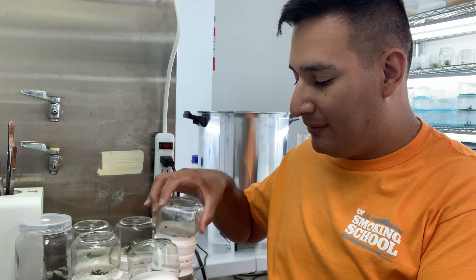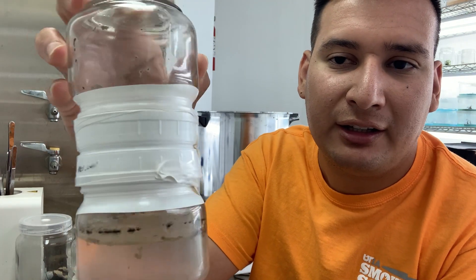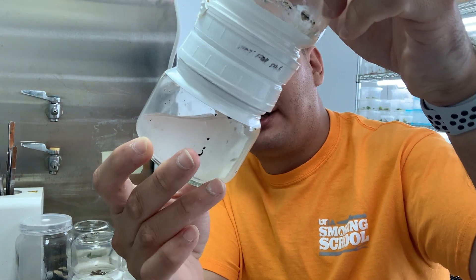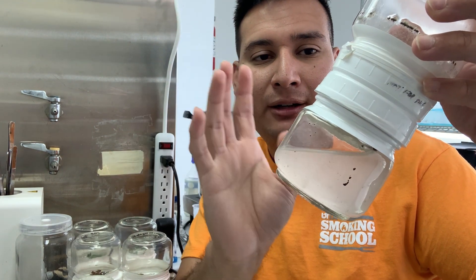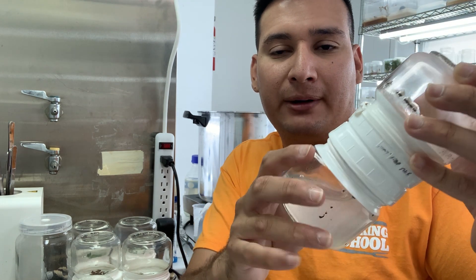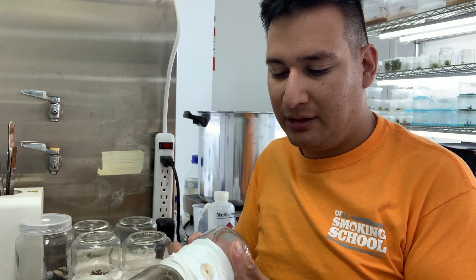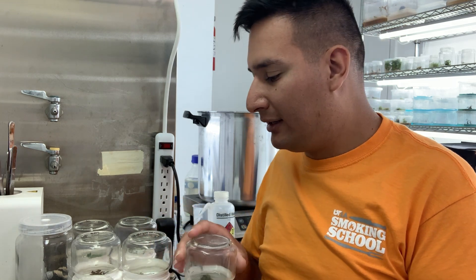Unfortunately, the Cephalotus got contaminated. I couldn't really notice it when I put the media in, but it was very cloudy, so I'm not really surprised it got contaminated. I want to take this plastic off, throw the plant away, clean it very well, and then put another plant in. I don't know if I want to use Cephalotus again, as it doesn't really do well in the bioreactors, so I may just start with another plant.